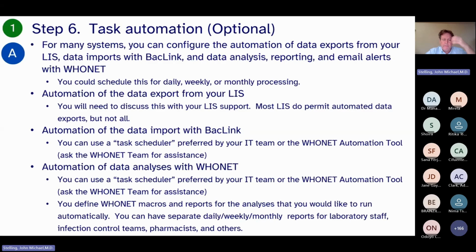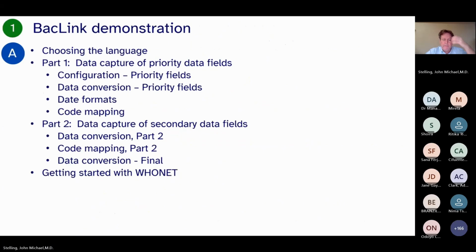One thing which I don't mention on the slide is you can generate reports on a schedule, and you can also email them. And they're doing this very nicely now in Eswatini, where all of the above steps are happening automatically, and then they email the laboratories at the end. So the laboratories are getting a lot of benefit without the additional work. We want you to focus on analysis, interpretation, data use. We don't want you to spend all of your time focusing on data acquisition and cleaning and data conversions.